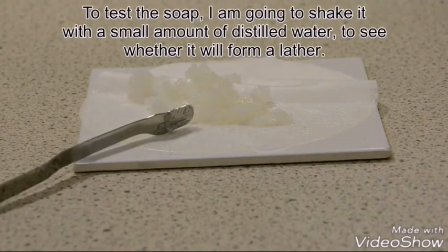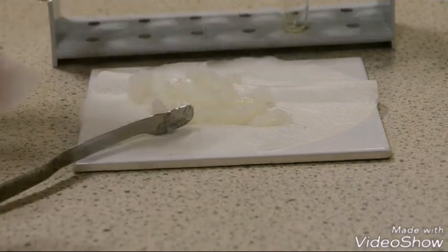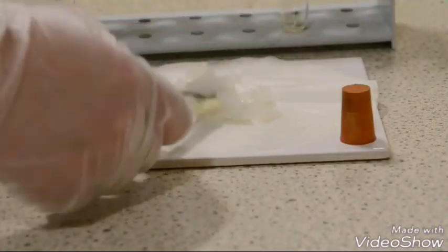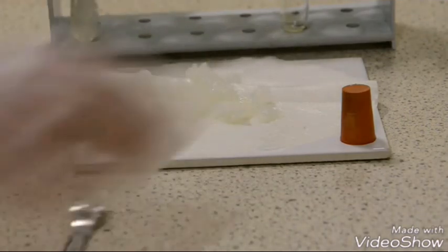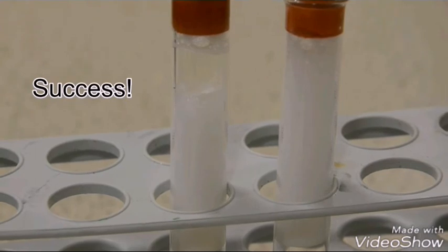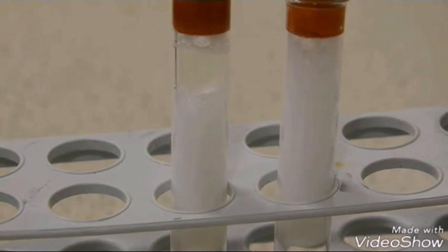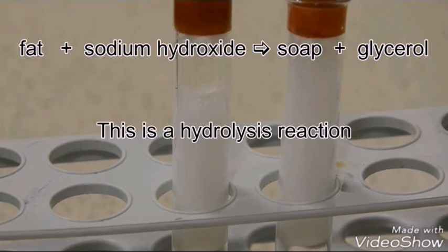To test it, all we need to do is take a very small amount of distilled water and put a spatula full of our soap in it and shake it to see if it forms a lather. And it does, so we've successfully made soap, but it's important to note that I'm not going to wash with this. It still has very hazardous alkali in it. To recap, saponification means making soap from a fat or oil and sodium hydroxide via a hydrolysis reaction.